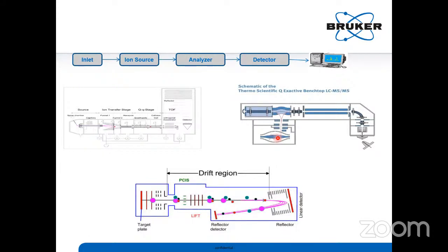In these cases you need Q-TOF, Orbitrap, timsTOF technologies, which will separate very closely related species, like 100.0025 and 100.0024. This much closely related species should also get separated.